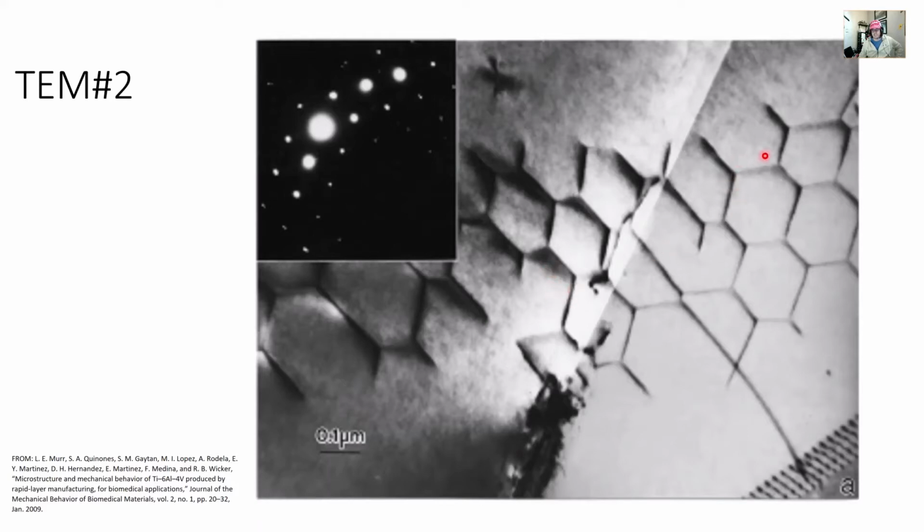But this is dislocation arrays, and they look like the idealized depiction of grain structure, because the dislocations, when they arrange themselves in a low energy fashion, give you this honeycomb type structure. I'm thinking this is two grains because I haven't looked at this article in a long time, so I've kind of forgotten, but this is a double diffraction pattern here. So we're seeing a diffraction pattern, I believe, from this grain and this grain. There's also some faults somewhere in there with these doublets.